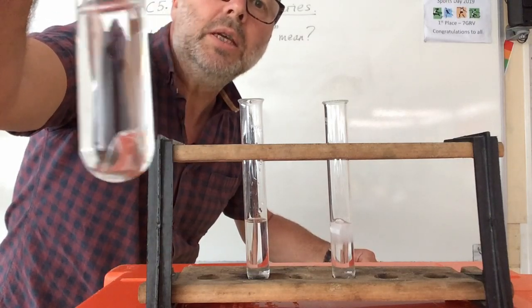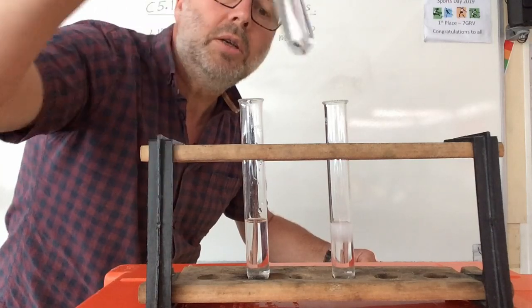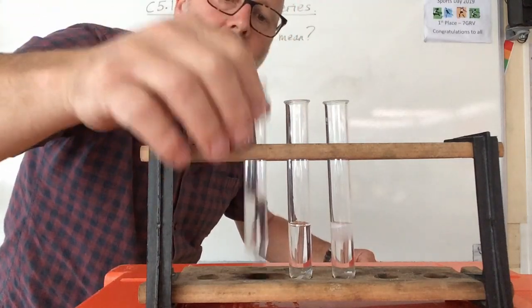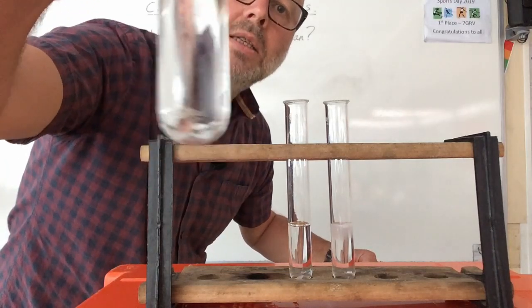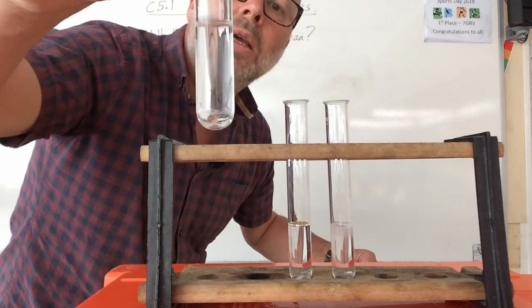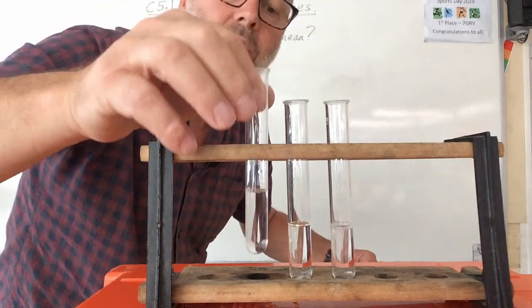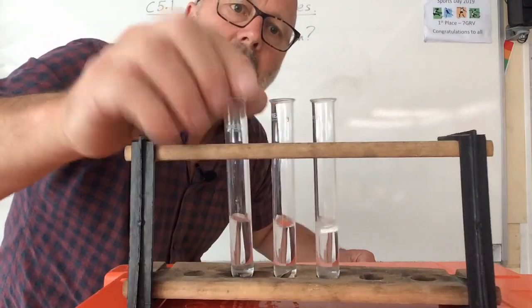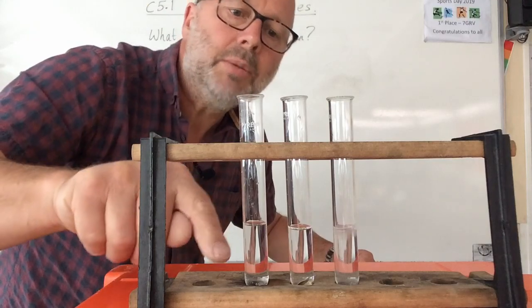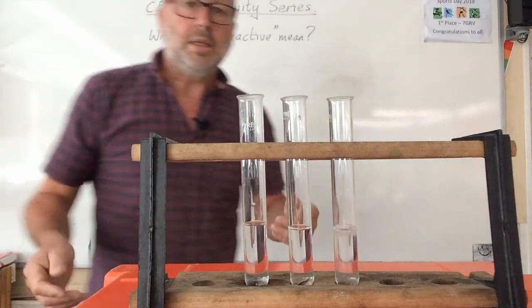What is that I've put on there? That is the little piece of aluminium. Is there much going on there? Not too much. And then I had zinc in here, and the zinc is in the bottom there. I can tell you from here, there are a few little bubbles on the zinc. Some tiny bubbles coming out from the zinc. Very little happening with the aluminium, and the magnesium is going a little bit crazy.